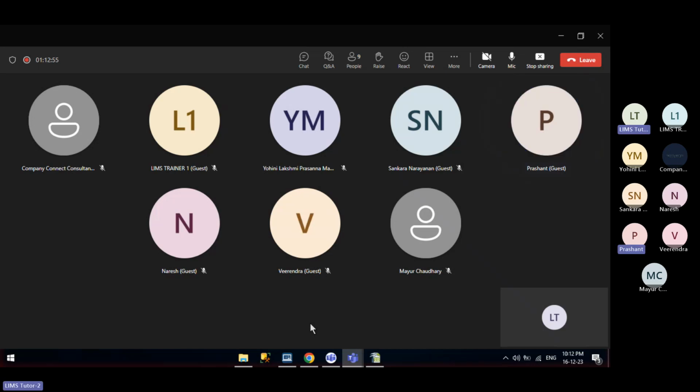Prashant, I understood your concern and your organization's concern also. We can share the technique followed by my previous organization when they started implementation from scratch, how slowly and gradually, module wise and material wise, they targeted the products.